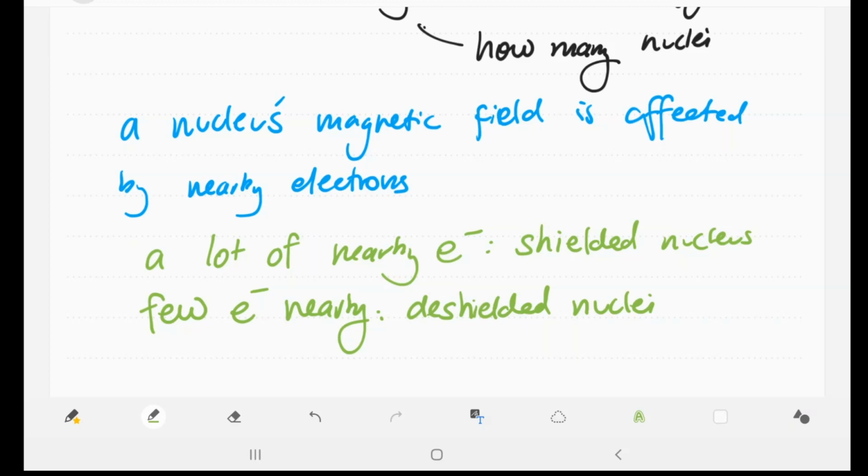I'm not terribly concerned if you know this theory. I'm more concerned with the practical aspects of this, because you can go ahead and watch a YouTube video on how NMR works, and you can see the machines and all that. But suffice it to say, you're just looking at when nuclei are absorbing magnetic field energy and flipping their spin. And that's it. That's all it is. Seems very simple, right? And it turns out that this depends also somewhat on the field strength that you're using.